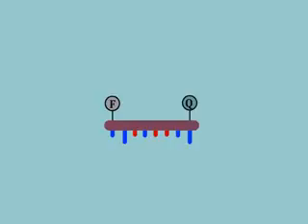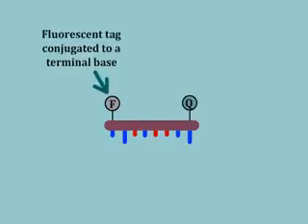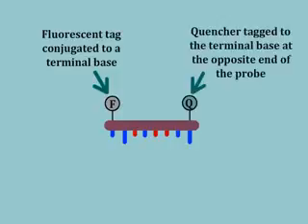However, unlike the primers, this probe is modified in a special way. One of its nucleotides is labeled covalently with a fluorescent molecule, and another nucleotide is labeled with a fluorescence quenching molecule. The quencher rapidly absorbs any light energy emitted by the fluorescent molecule as long as it remains in close proximity.